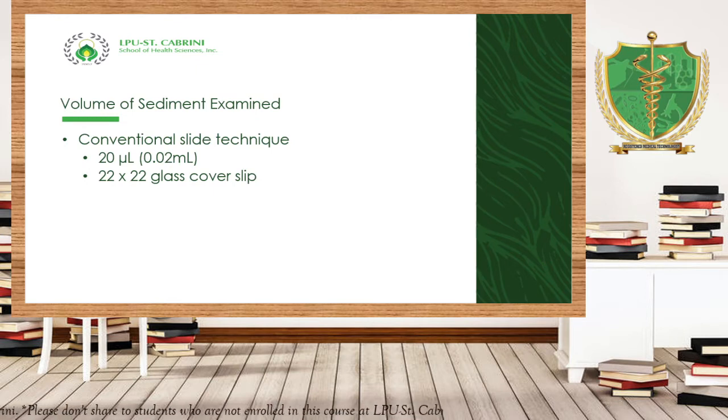Akala nyo ha? It is recommended, if you're going to use the conventional way of microscopic examination, to have a glass slide and a 22 by 22 cover slip. Okay? And then you are going to examine the slide for 10 visual fields. 10 visual fields ha. Hindi yung nakakita ka lang ng ilan sa ilang fields, you will stop and just estimate. You should examine the urine for at least 10 visual fields.